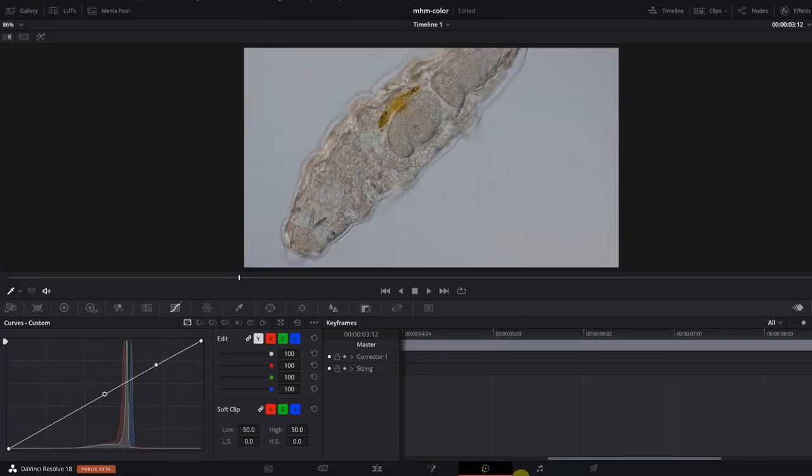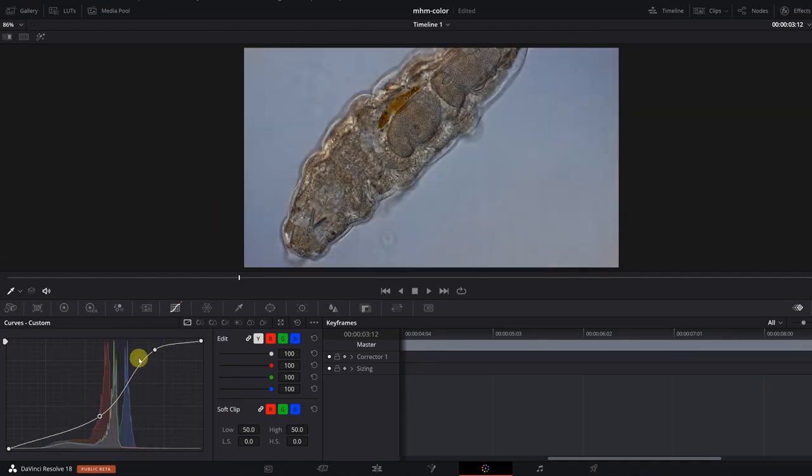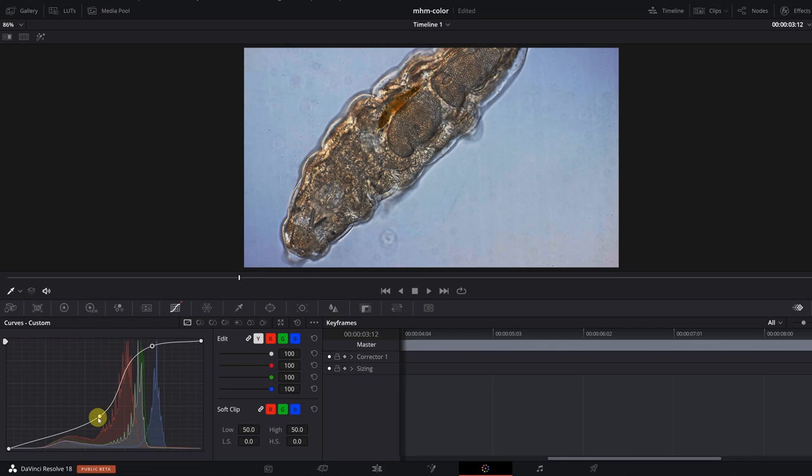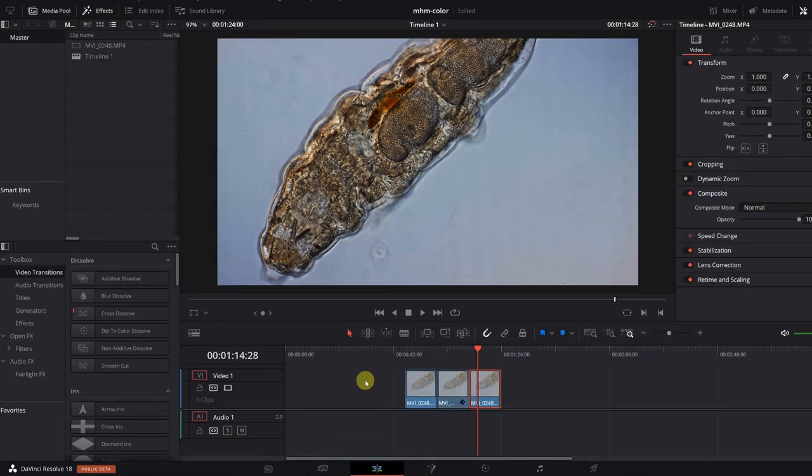Over here now, let's go back here again. I'm again in the histogram. Let's adjust the contrast again a little bit. Now I'm not going to make any color adjustments to it, I'm just going to leave it as it is, just with the improved contrast. So I've got three clips now and what I want to do now is export them.